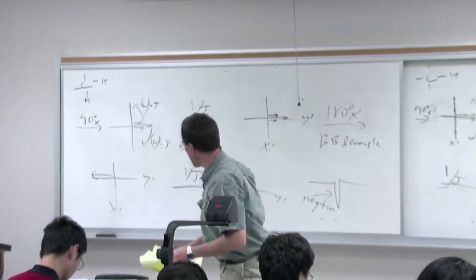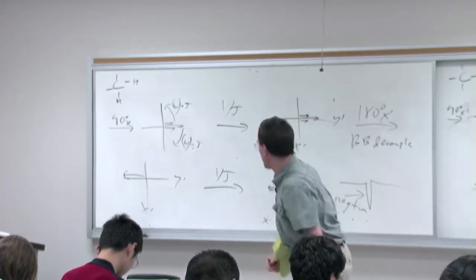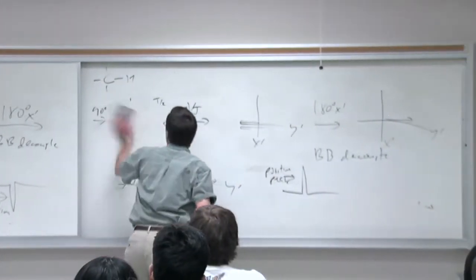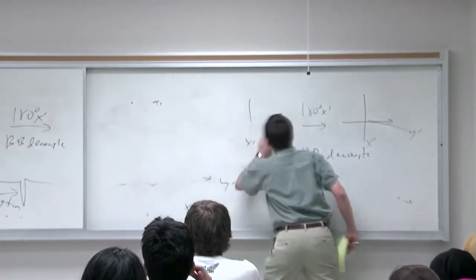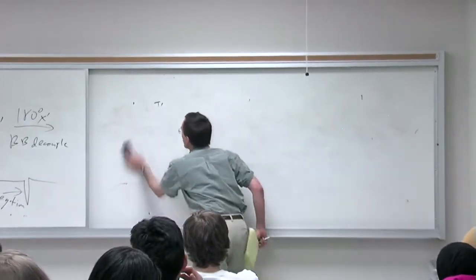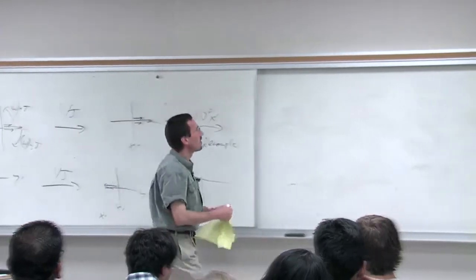All right, at this point, let me raise the 180-pound gorilla in the room that should be bothering you, and you've seen this, and some of you have found it confusing on the exam. That's the issue of what is J. Because the problem is, of course, you're going to do one experiment, and so you have to choose an average J.